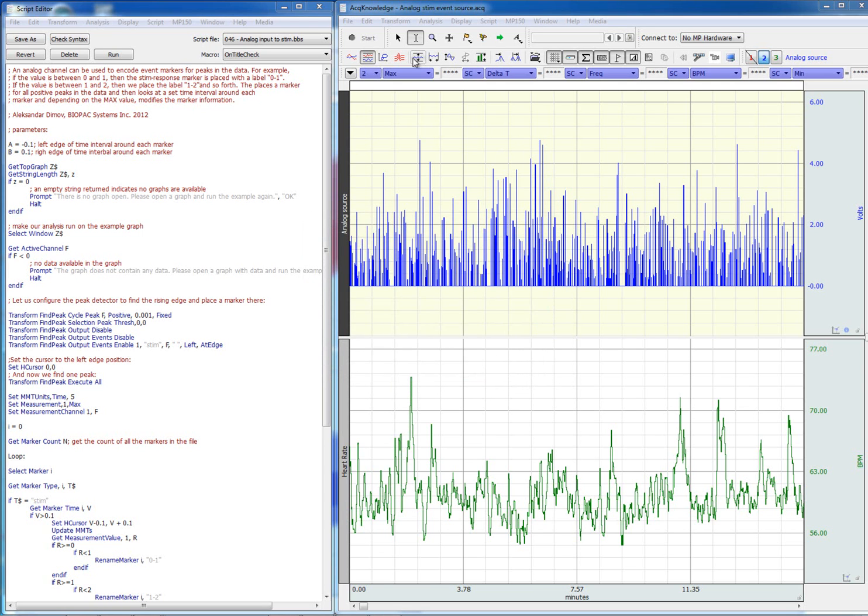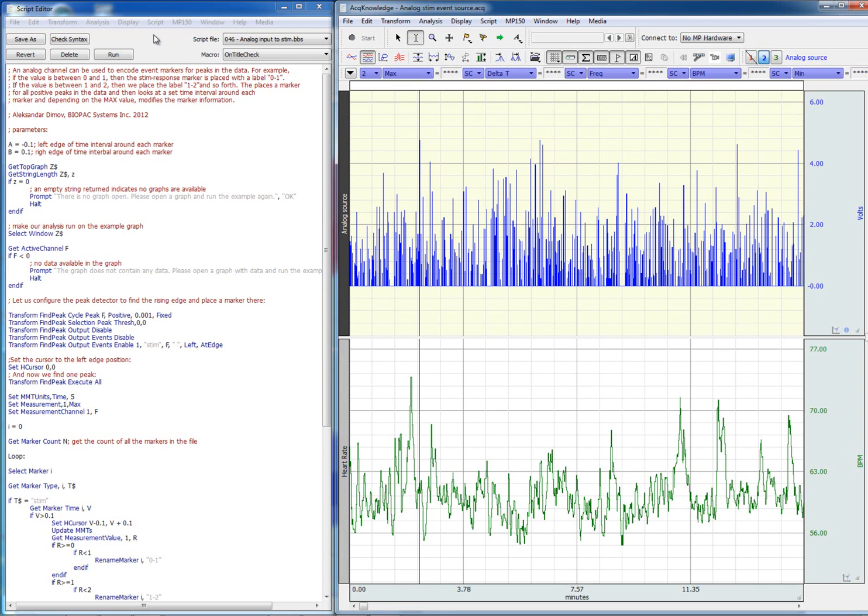As you can see, we have pulses that range all the way from zero up to about five, no more than six volts, and we can assign labels—markers with labels—depending on the amplitude of each pulse. Let's go ahead and run the script.